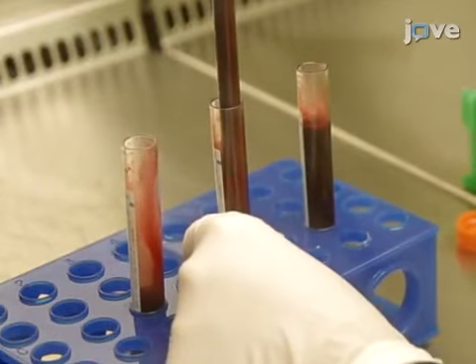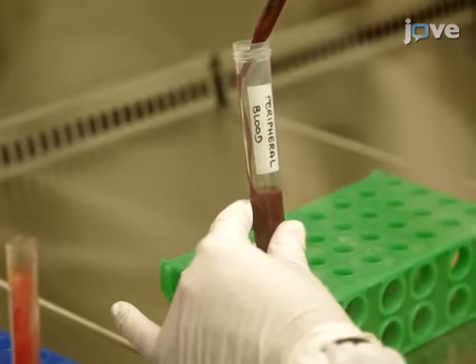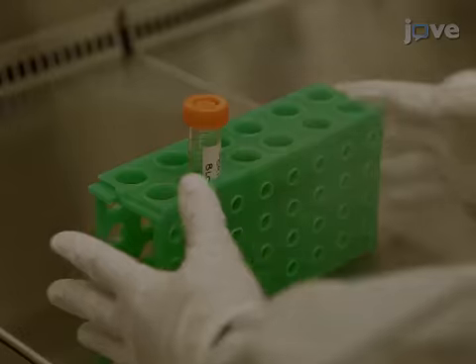Begin with collecting 8 milliliters of venous peripheral blood into a sodium citrate buffered plastic tube. Store the blood at 25 degrees Celsius and process it within 12 hours.